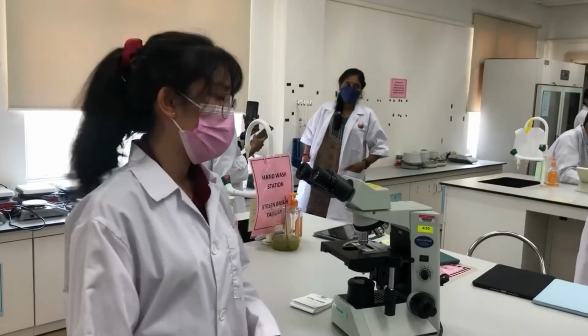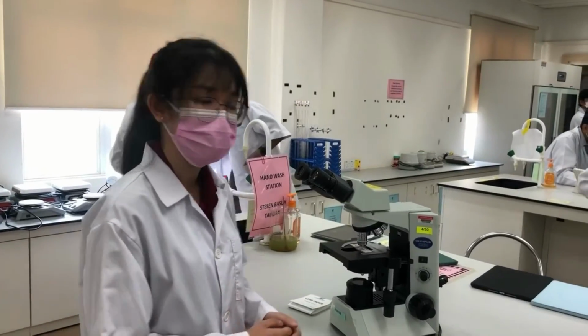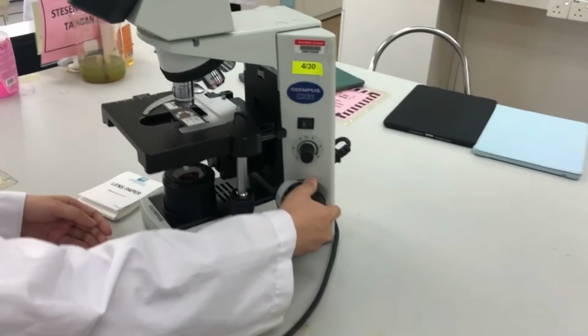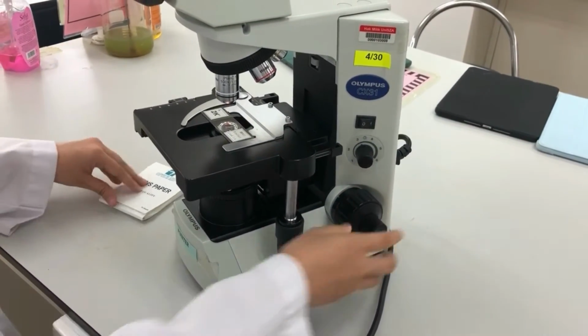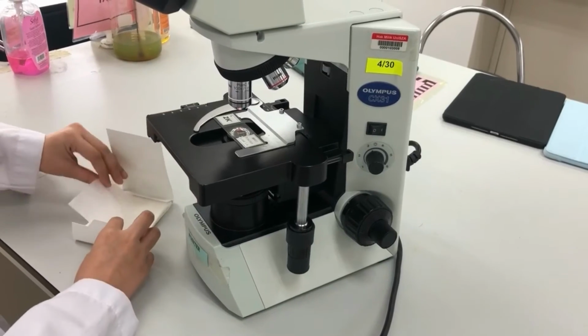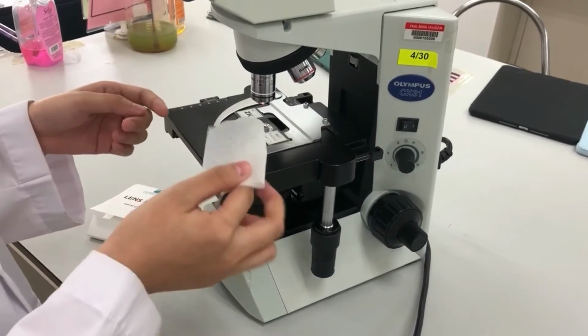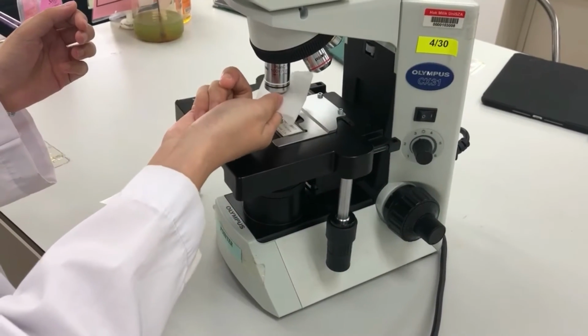Now I will show how to clean the oil immersion objective lens after using it. Firstly, we need to move the stage downwards carefully. Take a lens tissue. Clean the oil immersion objective lens by gently wiping it with clean lens tissue.